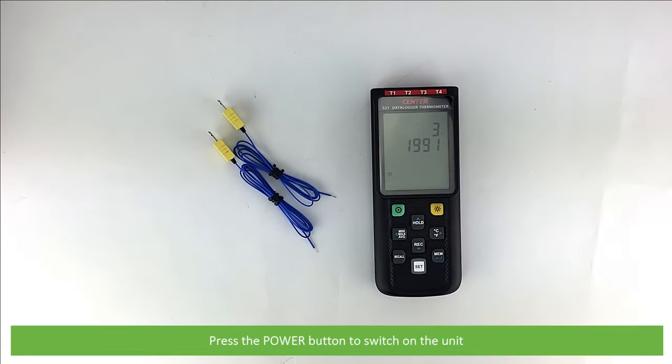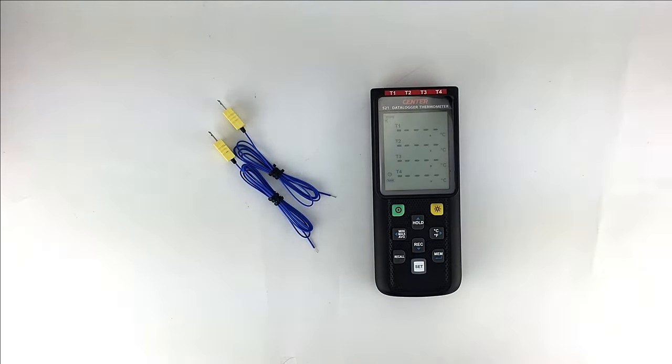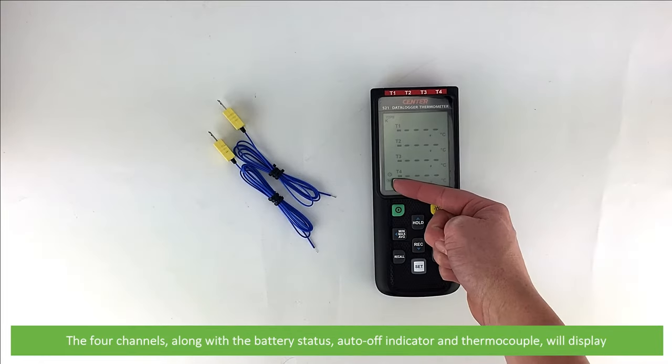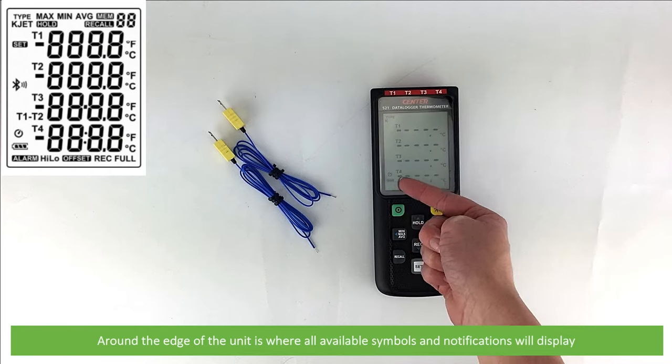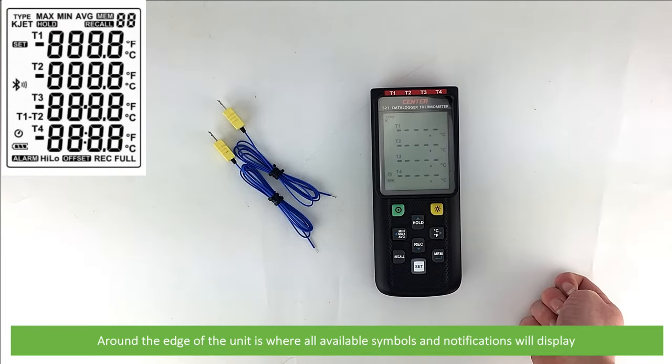Press the power button to switch on the unit. The four channels, along with the battery status and thermocouple will display. Around the edge of the unit is where all available symbols and notifications will display.